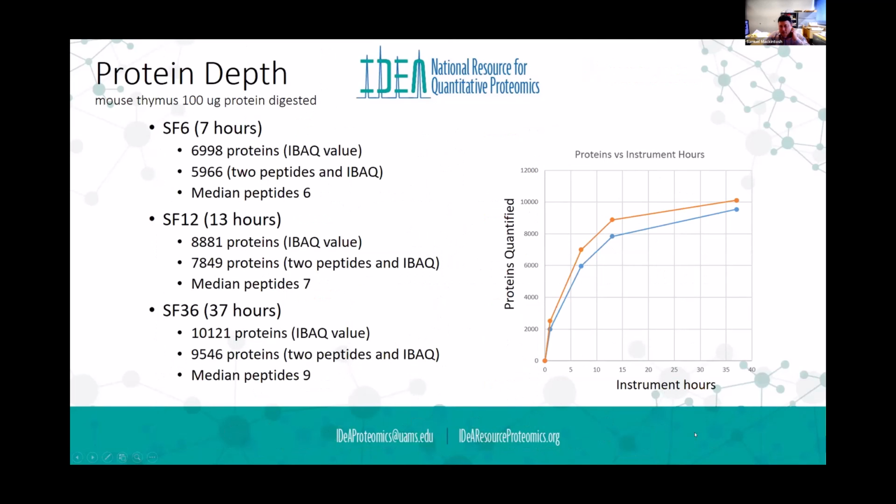That's the secret, really, basic to global proteomics: to start with complex samples and treat them in a strategic way to get the most out of the instrument time you have available, applied across the complexity of the sample.